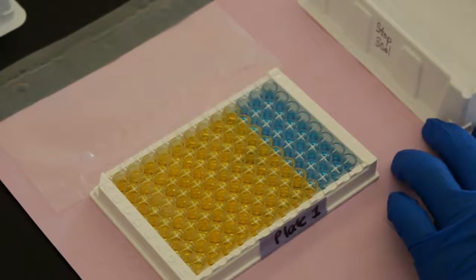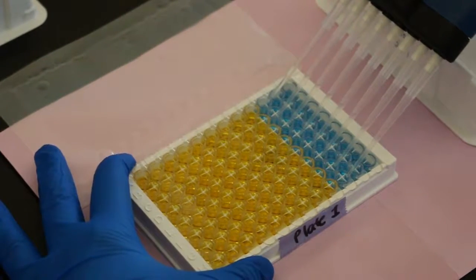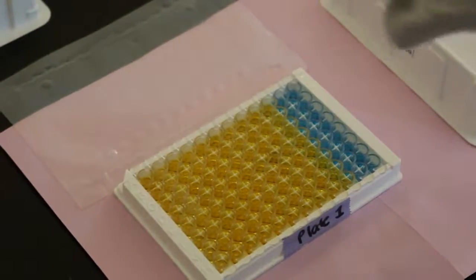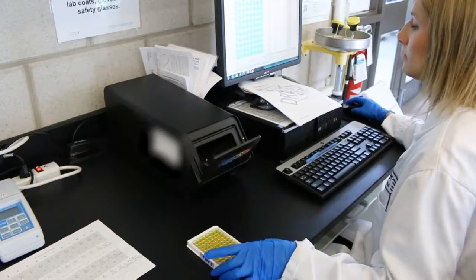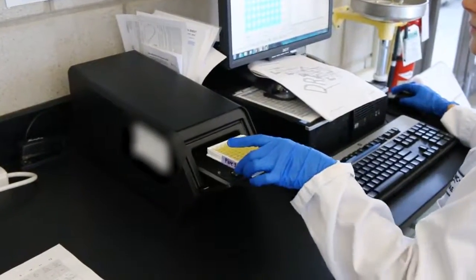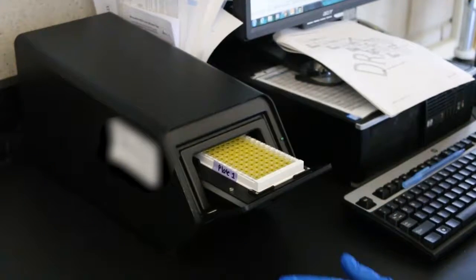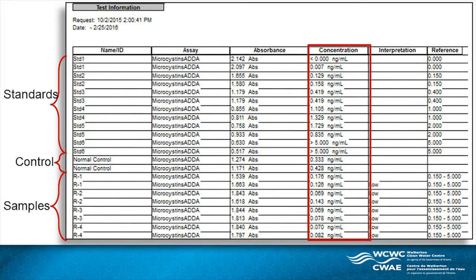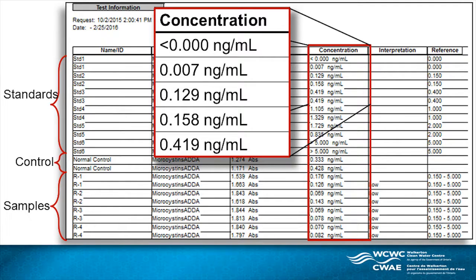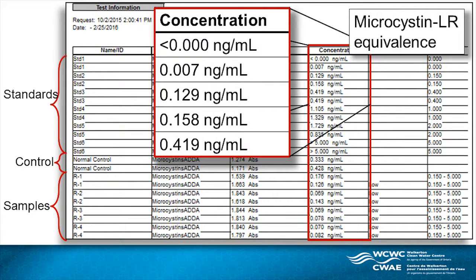The plate must be read by the ELISA photometer within 15 minutes of the stop solution being added. The plate is loaded onto the photometer tray and is analyzed when initiated by the software. The tray is read once at 450 nanometers and again at 630 nanometers. Test results can be viewed on the reader software program and are expressed as microcystin LR equivalents.